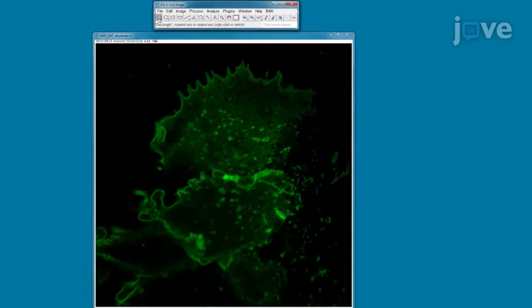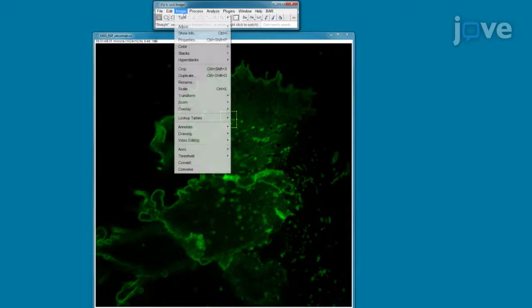Start by identifying the apical or basal cell surface membrane region of interest in the first image. Select a pixel size of 2 to the n in the range of 256 by 256, 128 by 128, or 64 by 64.